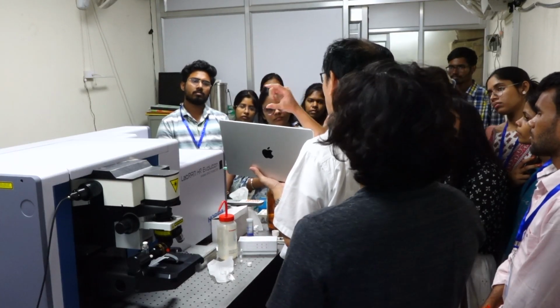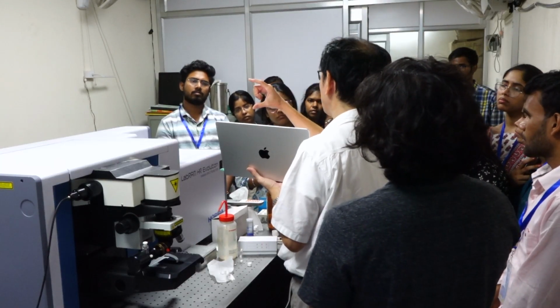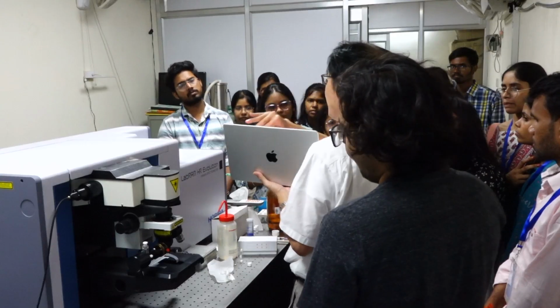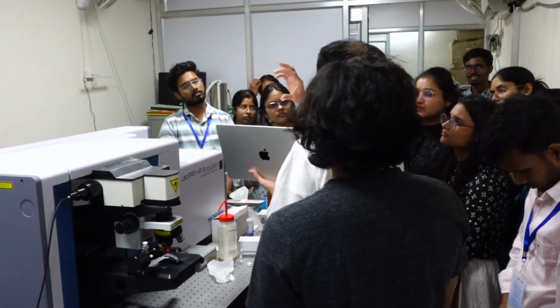How about 1.5? Okay, 1. So it digitizes the continuous number to a digit number.